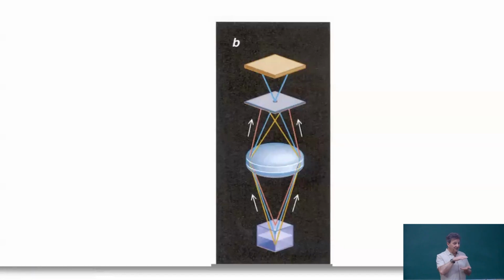So you are basically looking inside a material, as long as it has a reasonable degree of transparency, of course, and you are killing the things which are before and after. It's like seeing my skin without taking my shirt off. You do confocal to see my skin through the shirt, and you cancel the signal from the shirt, and then you get to see the skin inside. And of course, you are not dealing with centimeters. Usually you are doing that with microns. You are doing that for research.